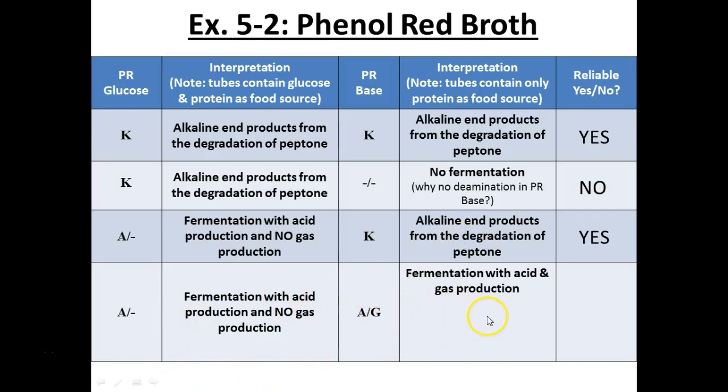Can you get acid and gas production in a protein-only tube? No. So therefore, this would not be a reliable result, right?